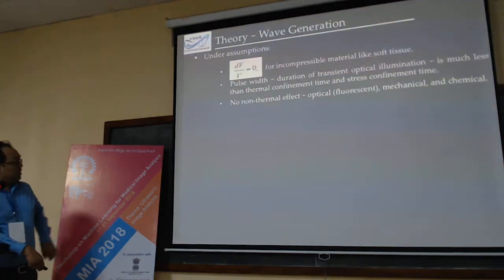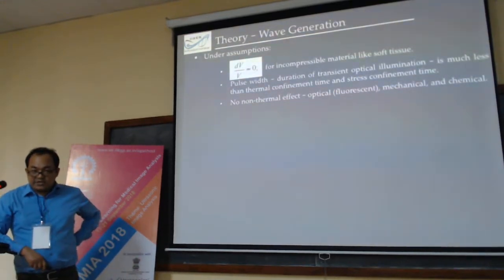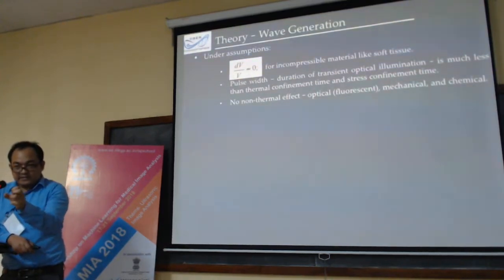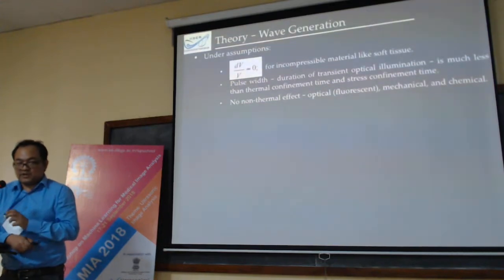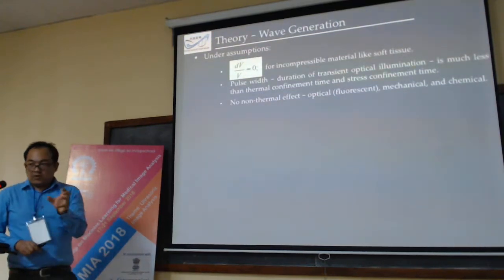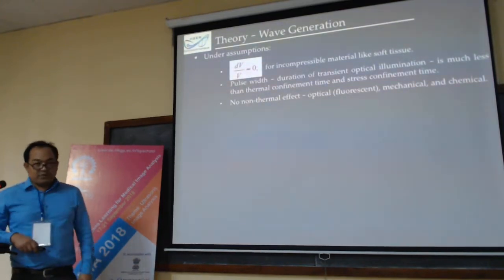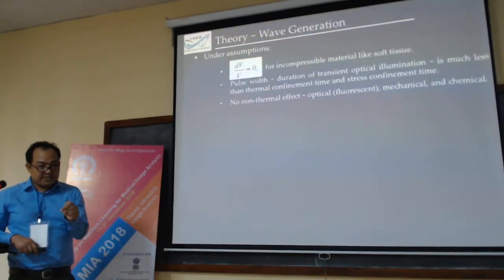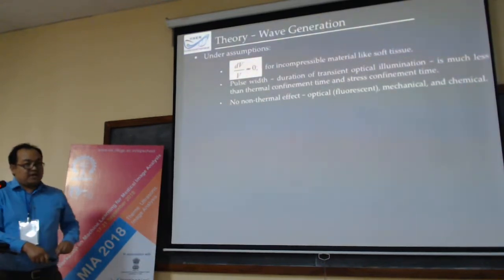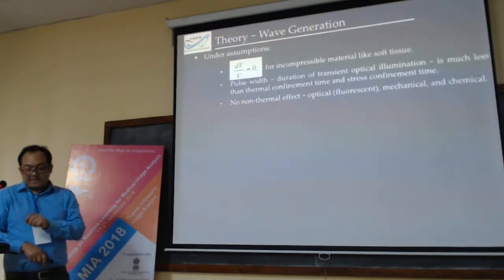So, for the tissue material that is incompressible, it says that the volume cannot be changed. Just like water, if we press it, the entire volume cannot be changed; the surface area will be changed. Just like this, for soft tissue the whole volume is not changed. Simply, we can consider that the relative change of the volume, the change in volume with the thermodynamic process with respect to the entire volume, is negligible compared with the other terms on the right hand side, beta delta T plus kappa delta P.